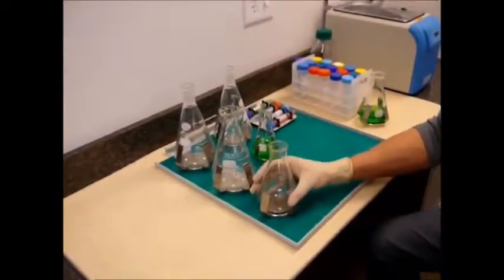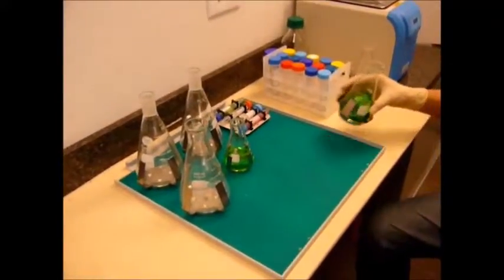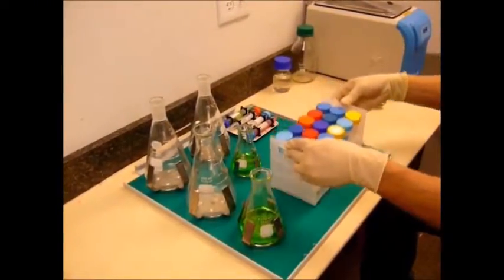With the new Magic Clamp platform from Benchmark, clamp exchange is simple, instantaneous, and tool-less. Just remove and attach clamps by hand, utilizing the patent-pending mimetic system.